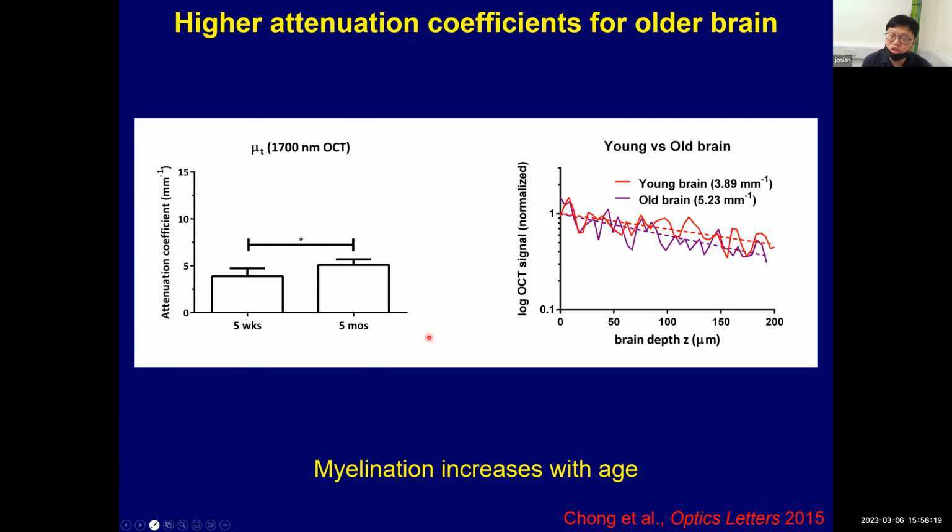It's also good to highlight that in a lot of the papers that get published trying to look deeper, you may have to pay attention to what kind of brain they use, whether they are using an adult brain or a very young brain. From what I heard, it's still quite challenging to image the adult brain, even using 3-photon microscopy, which is one of the most powerful multi-photon technologies for deep penetration.